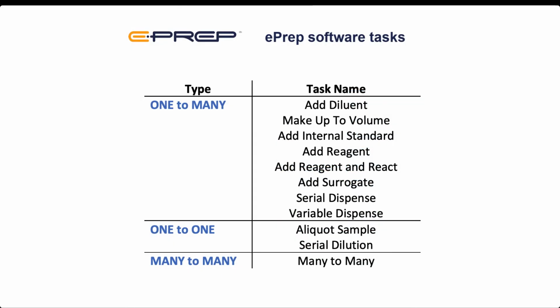A summary of all the liquid handling tasks can be seen here in this table. Hopefully, when creating your workflow, you will now be able to see which of these liquid handling tasks is suitable for your particular application.